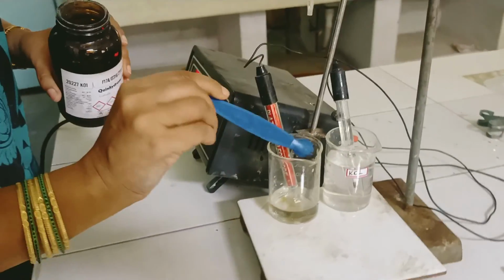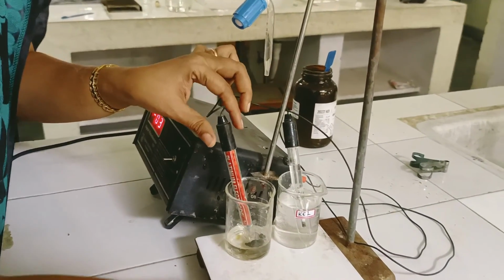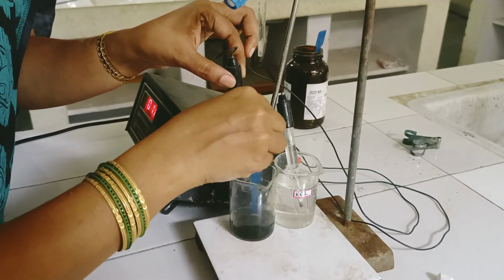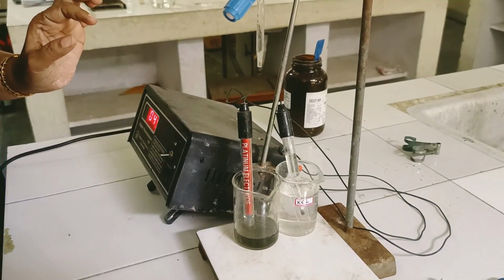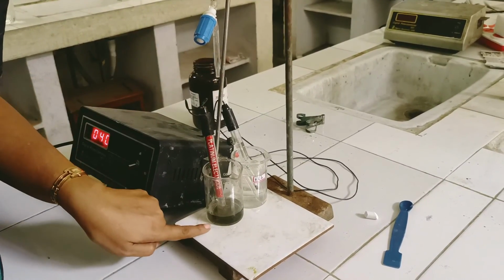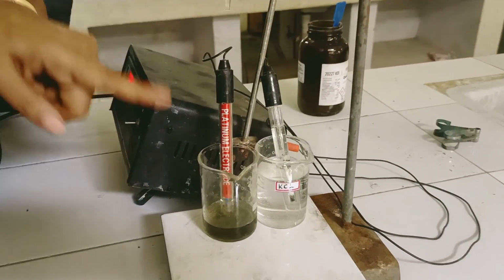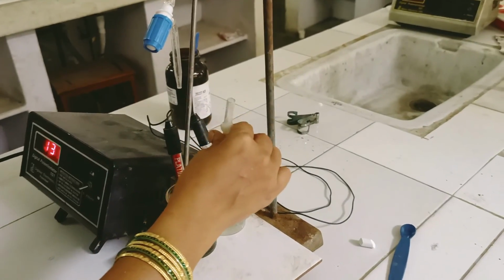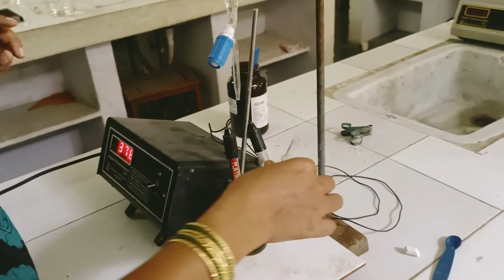Now let's add a pinch of quinhydrone. This is a 1:1 proportion of quinone and hydroquinone. I just stir it properly and then place it. So this is the reduction half cell, platinum along with HCl solution with quinhydrone, and the other half cell is the calomel electrode dipped in the saturated KCl solution. Now in order to obtain the proper result from the potentiometer, I am placing the salt bridge connecting both the half cells.